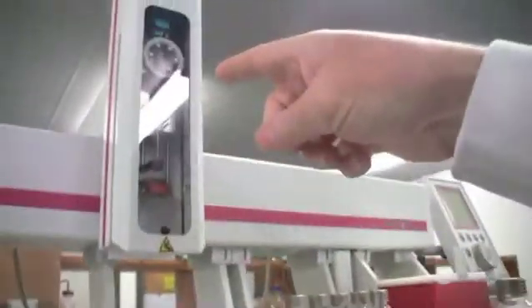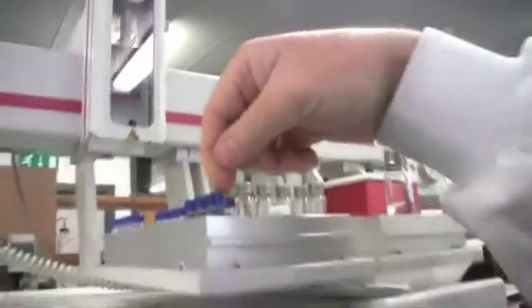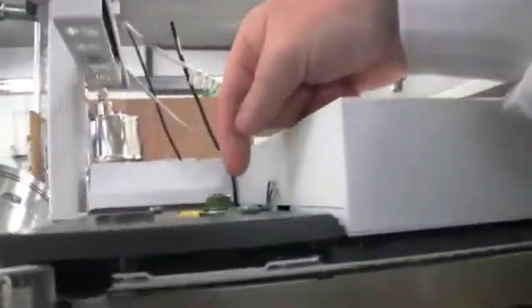This automated system here comes down, takes a representative aliquot and injects it into this gas chromatograph. Inside the gas chromatograph, it actually will then separate each one of the compounds on a series of different columns.